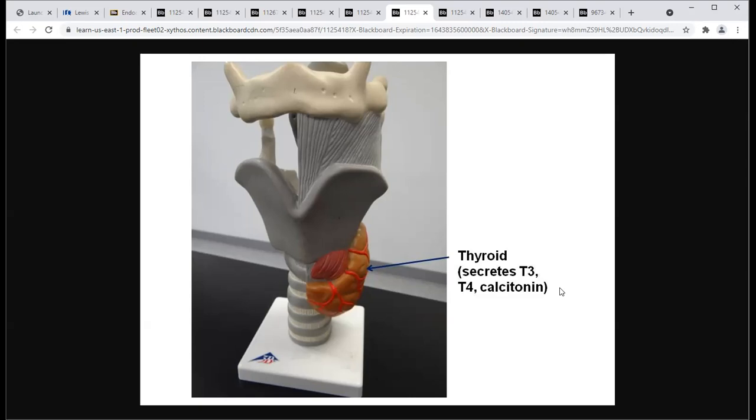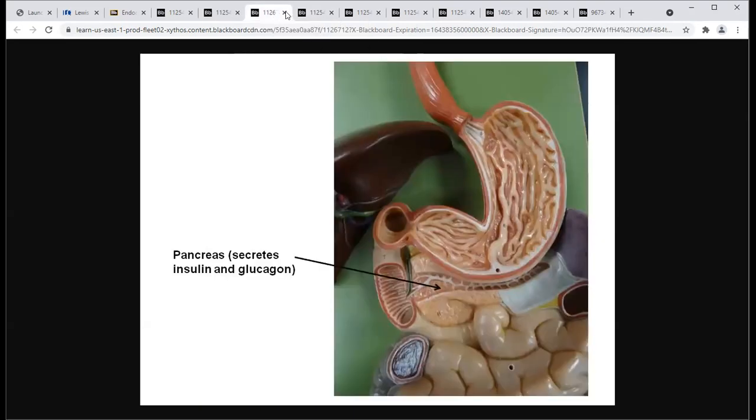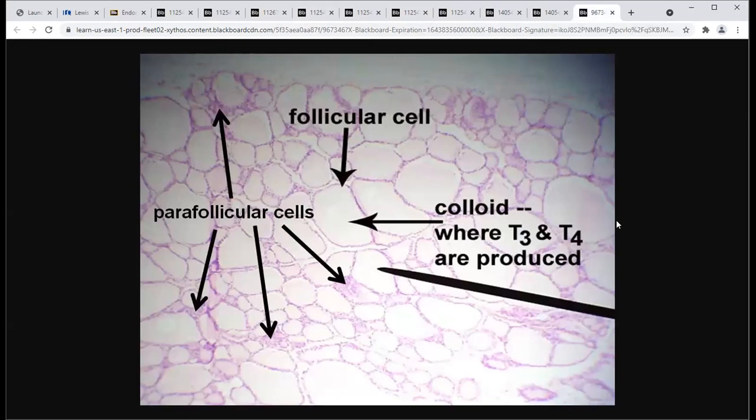In addition to these two strikingly different hormones, they are produced at strikingly different locations within the thyroid. The thyroid gland has a very peculiar microscopic structure. Let me see if I can find this among the list of microscope slides. I'm going to try to go here, and no, I think right here. So you see the microscope slide for thyroid gland.